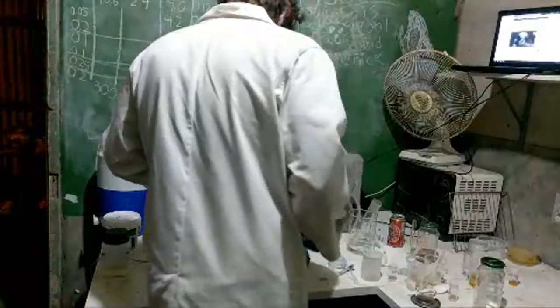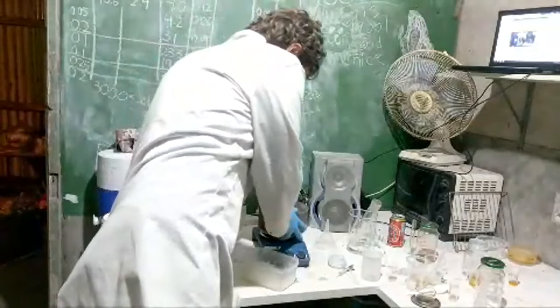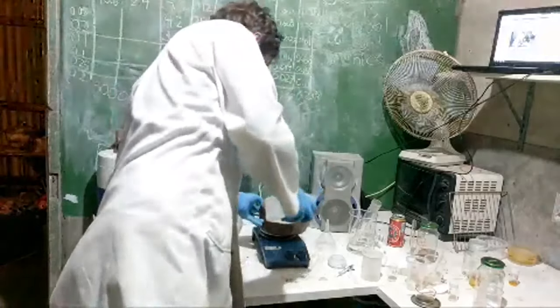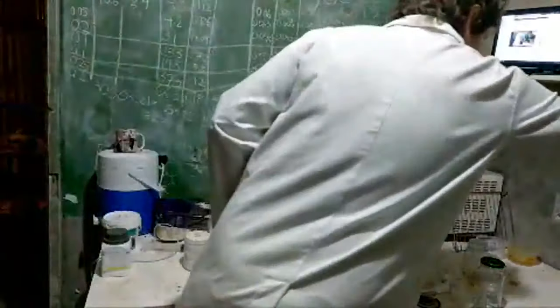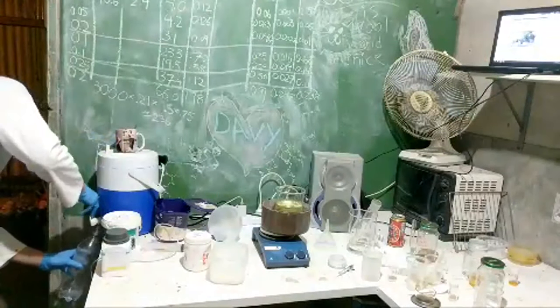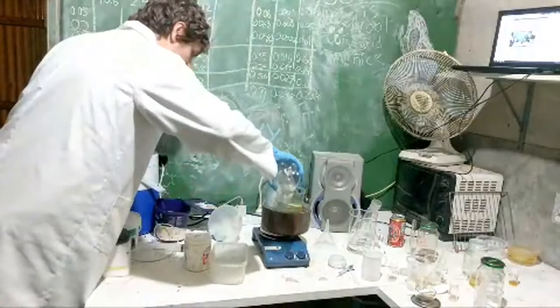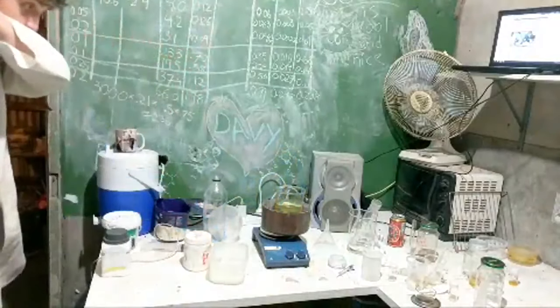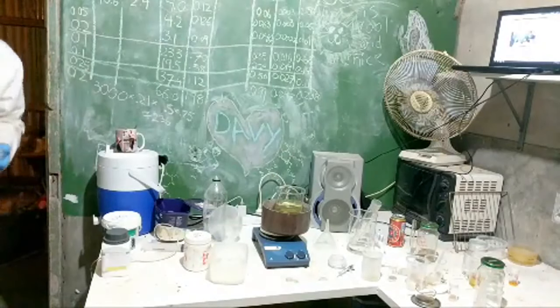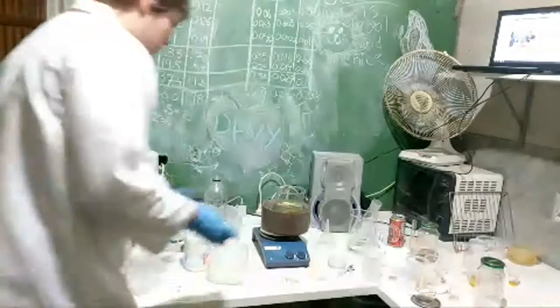Did that in the wrong order. That goes in here first, and then I've got that. The water, this is just an empty thing. Now, stir bar. Let's see if I got an actual clean stir bar. Yeah, that'll be good enough. That one there. Should be fine.